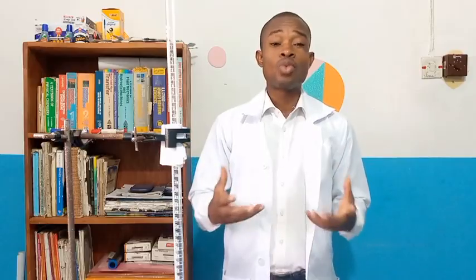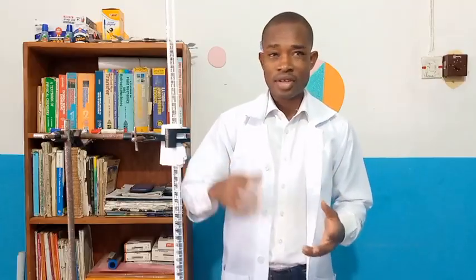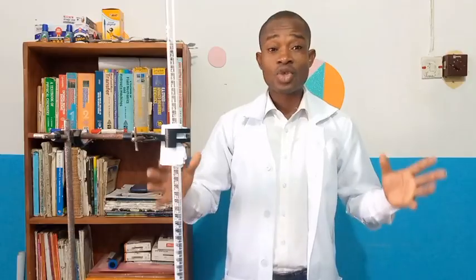You see, this experiment is going to be an interesting one because I'm going to explain clearly how you can carry out half cell reaction equation balancing, especially when you deal with the concept of the charges, the oxidation number of the major components that are reacting in the given solution.